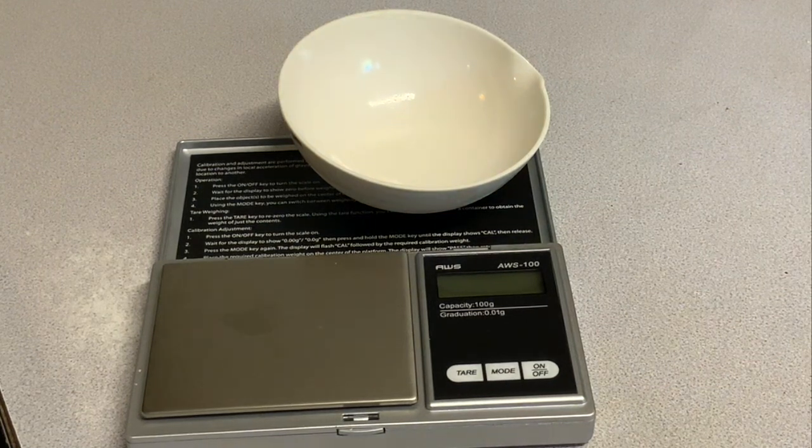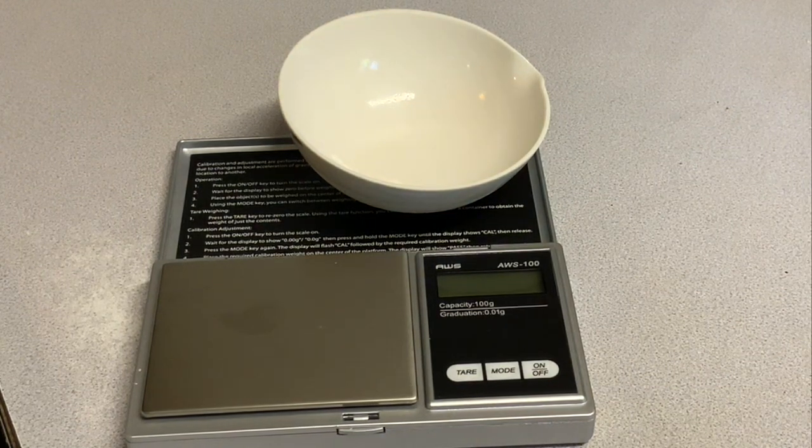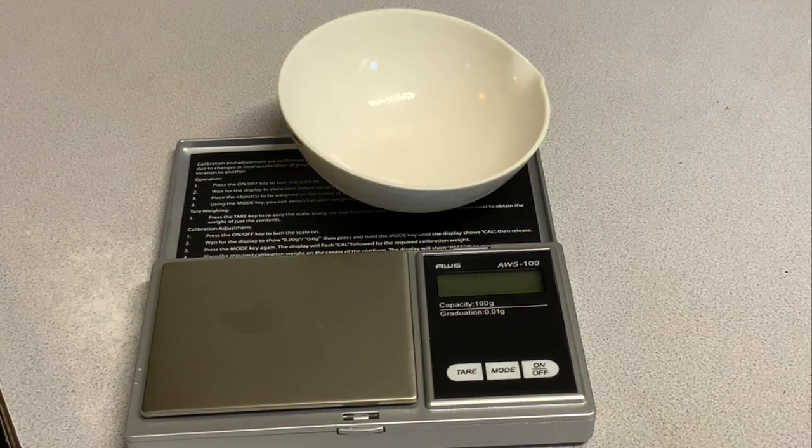I'll allow the evaporating dish to cool again. Give it a couple of minutes.